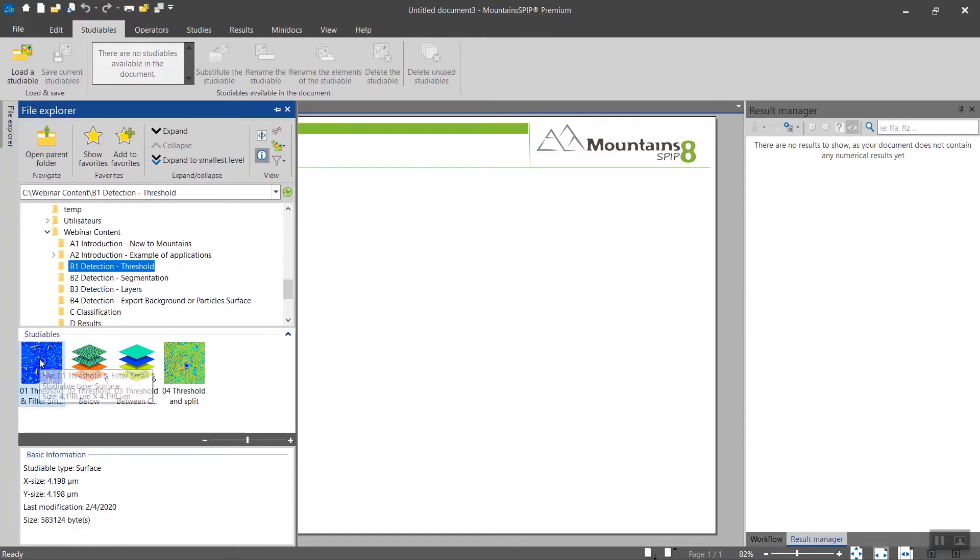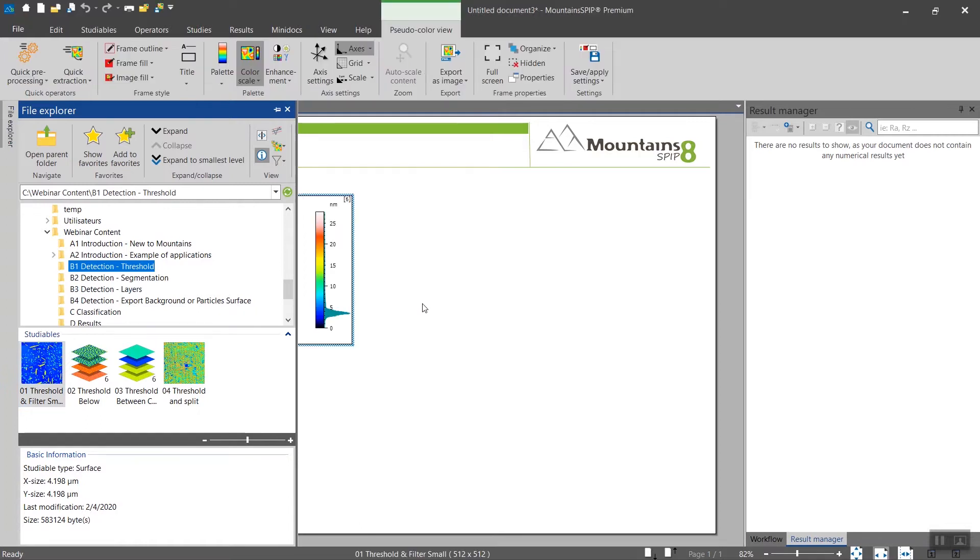The first part of the particle analysis is the detection. So let's bring a studyable from the File Explorer.